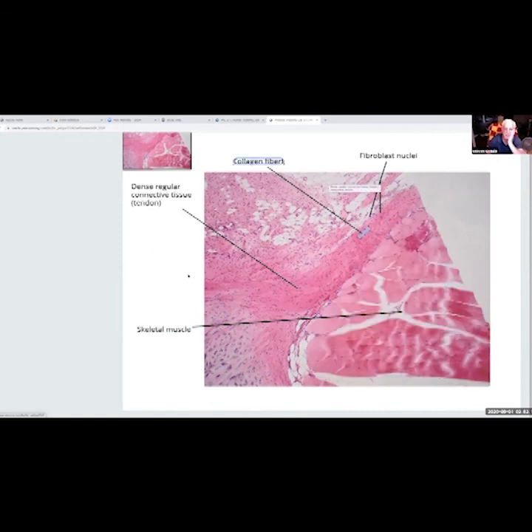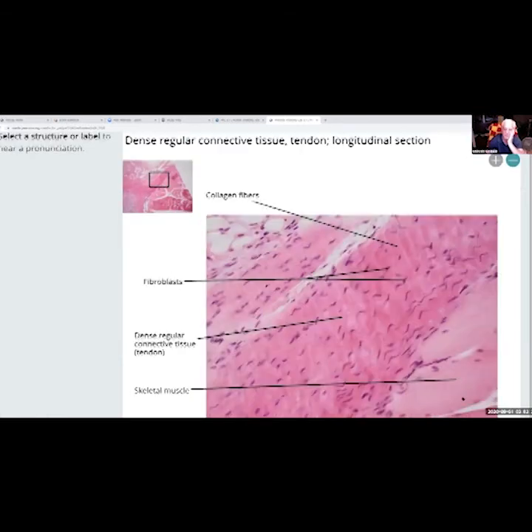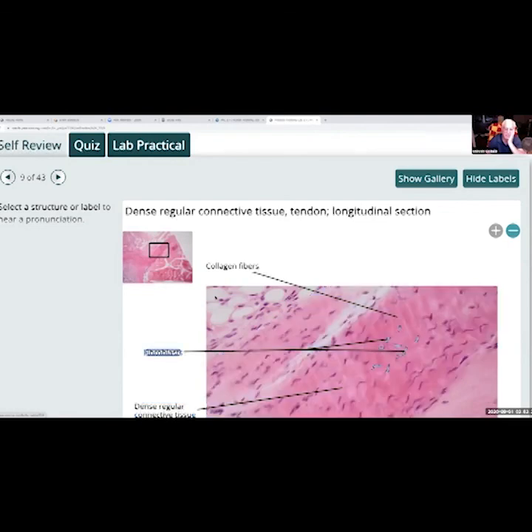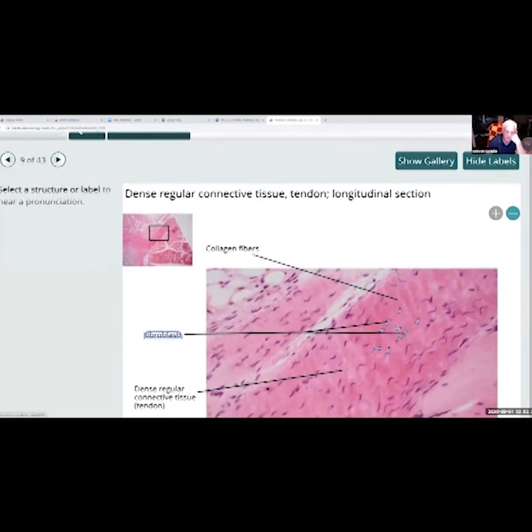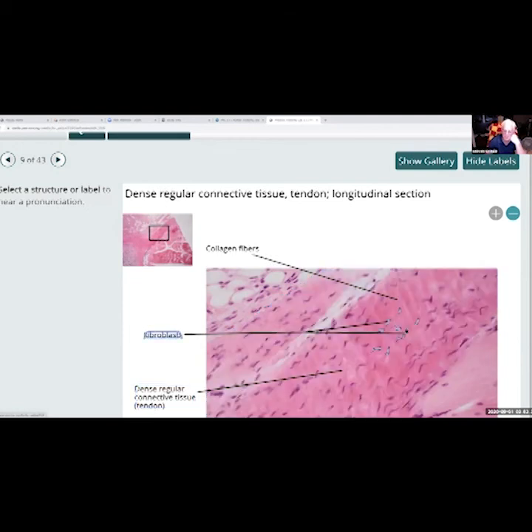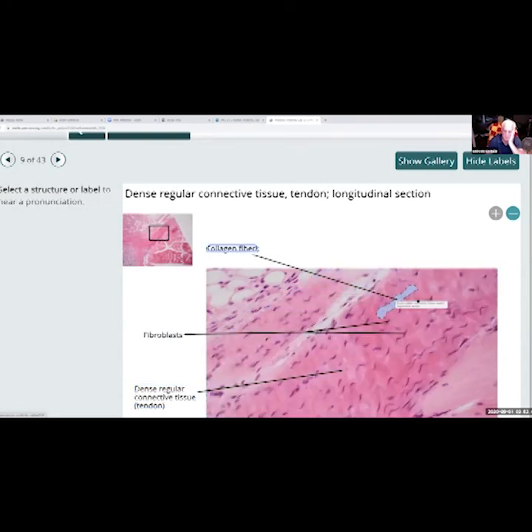Connective tissue again. These are fibroblasts. Okay, if we look, I'll get rid of those for a second. We look right here. What is this cell I'm pointing at? Fat. Perfect. You got it. Fat cell. Adipose cell. You got your connective tissue, and you got your fibroblasts inside. Again, the fibroblasts are the cells that produce connective collagen. And these are your collagen fibers. You can see how it's all full of fibers here.